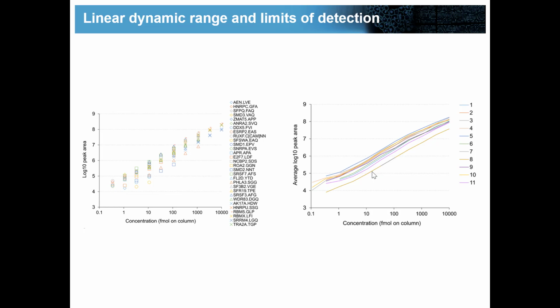DIA is also compatible with doing other kinds of isotopic labeling, either synthetic peptides or SILAC or other kinds of metabolic labeling. These can be included, but they do need to be handled properly in the software. And we have seen, especially in the case of SILAC, when you try to analyze a SILAC sample, sometimes the sensitivity goes down, the number of peptides you can detect goes down, because what you're doing is taking very, very complex spectra already and making them twice as complex, basically.